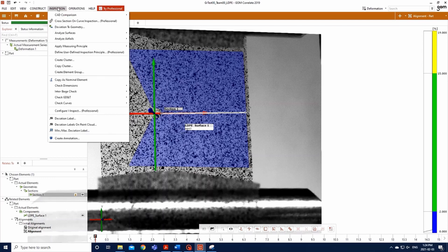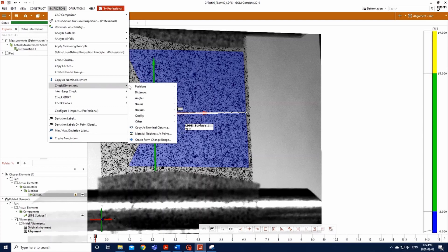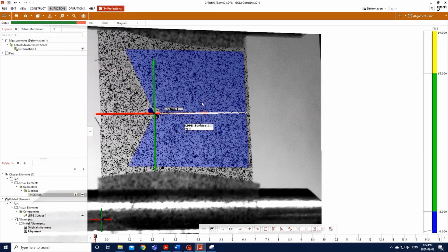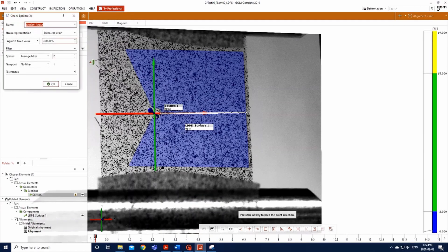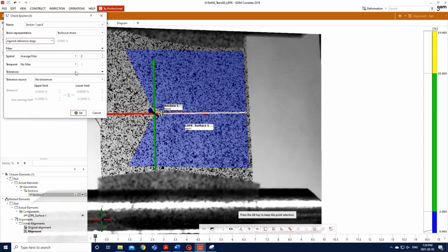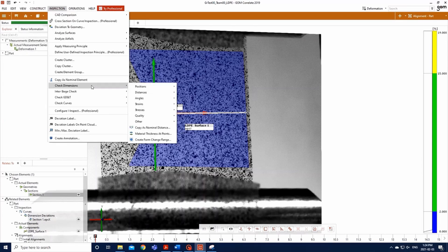Then go to Inspection, Check Dimensions, Strains, Check Epsilon X, Epsilon X, and the window will pop up. There, input to check for the technical strain of your sample against the reference stage, with an average spatial filter of 2 knots, as you did previously. You can now repeat the last step to check Epsilon Y.